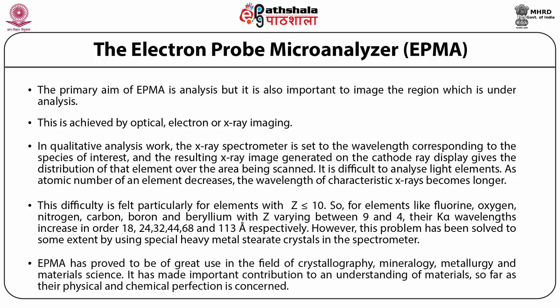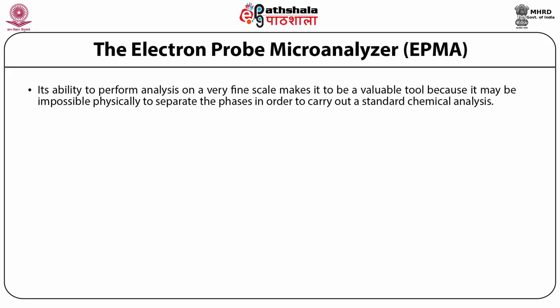EPMA has proved to be of great use in the field of crystallography, mineralogy, metallurgy, and material science. It has made important contributions to an understanding of materials so far as their physical and chemical perfection is concerned. Its ability to perform analysis on a very fine scale makes it a valuable tool, because it may be impossible physically to separate the phases in order to carry out a standard chemical analysis.